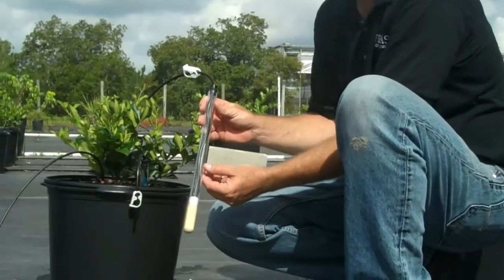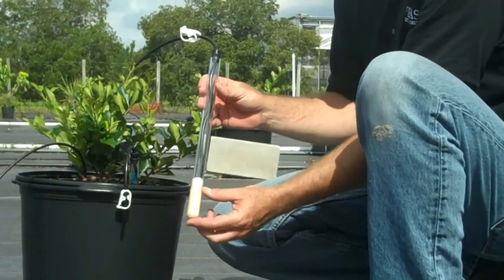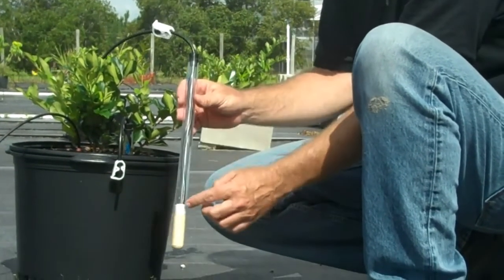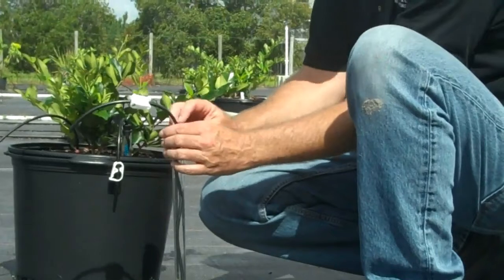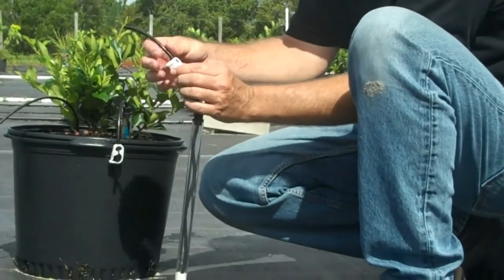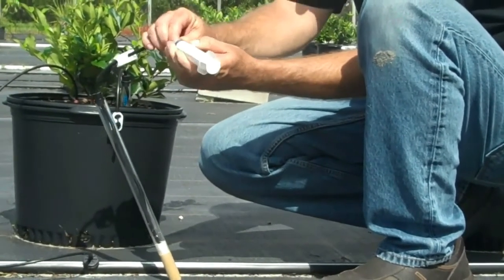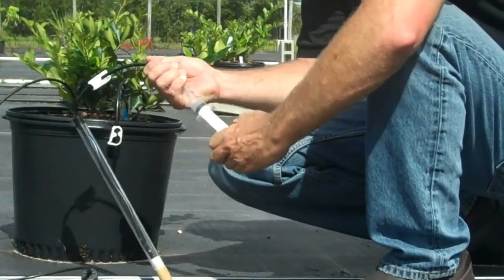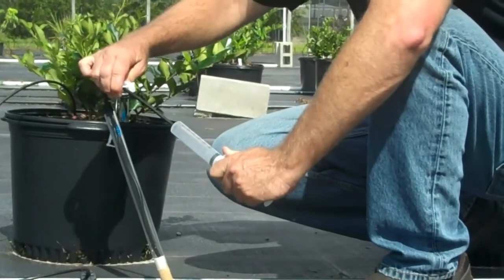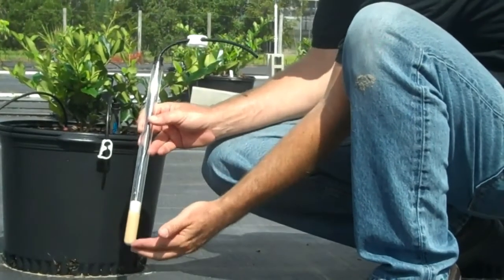Here we have a lysimeter set up, and what a lysimeter is, it's a tube of some kind, whether plastic or glass. In this case it's a glass one. You have a ceramic porous tip, and a tube that runs the whole length of this and down to the bottom where it can collect water. It has a rubber stopper on the top, and here is a crimp to crimp the tube when you pull the pressure. You can use either a pump, or in this case, since it's a small lysimeter, we're able to use a syringe. You pull the pressure with the syringe, and with this lock, you lock it in place, and now this is set to pull water from its surroundings.